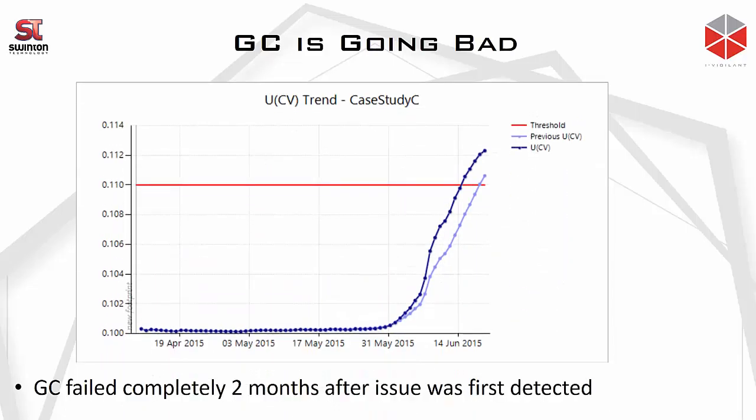So this is actually showing the two trends between the overall data and the last 30 days data. You can see the last 30 days data actually reacts a lot faster, which is the dark blue one, and the light blue one is the overall data that we have from there, but it's still giving us pretty much the same similar trend, and this is because we don't have too much of the data prior to the GC failure.